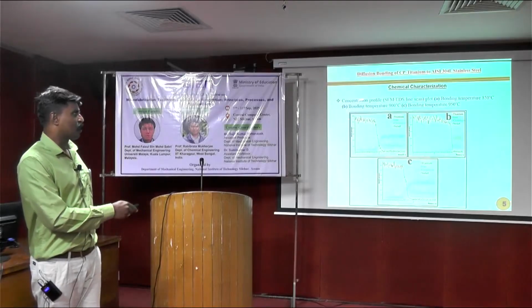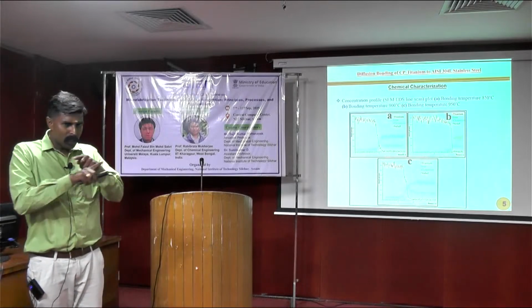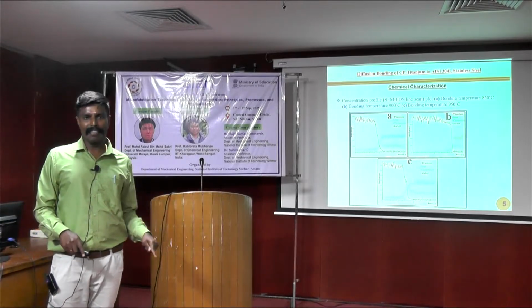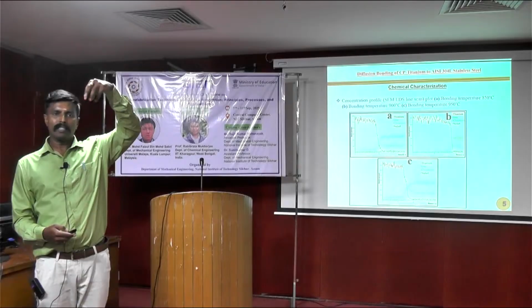This is called EDS analysis. EDS analysis is nothing but energy dispersive spectroscopy. Across the joint interface, we can do the line scan analysis. That line scan is done by the characteristic X-ray coming out.